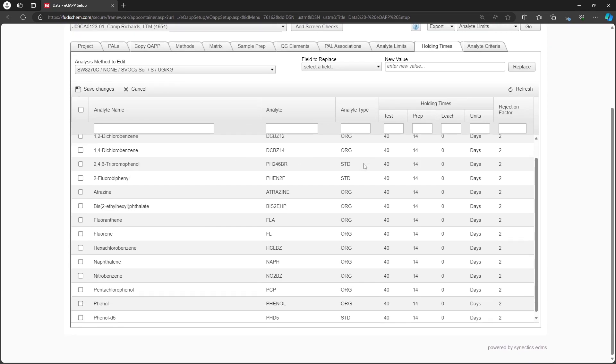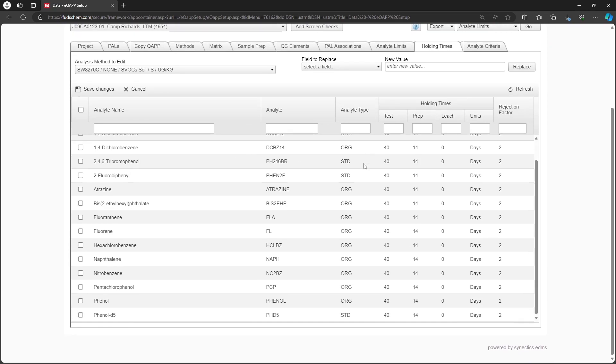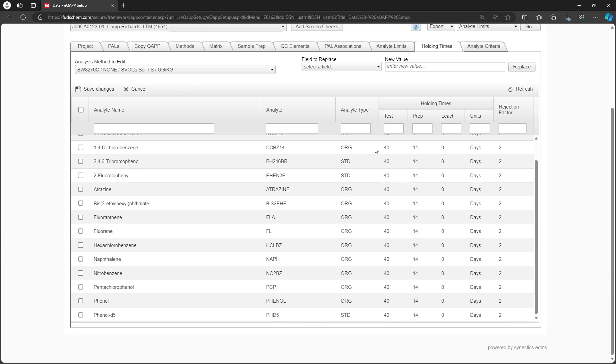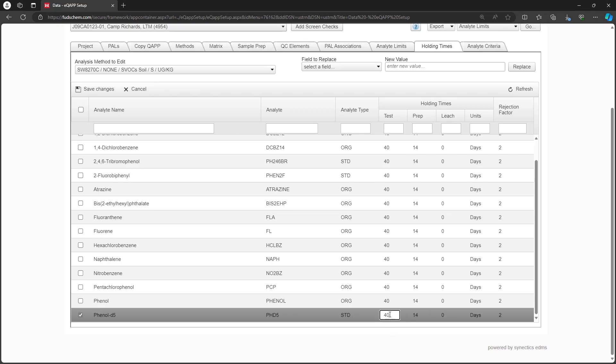On this tab, any new Analytes that we added are automatically given the same holding times as the original Analytes. However, in some cases, the holding times may be blank. We can populate the hold times by typing into the fields, or by selecting the rows we want to update and using the Field to Replace option.